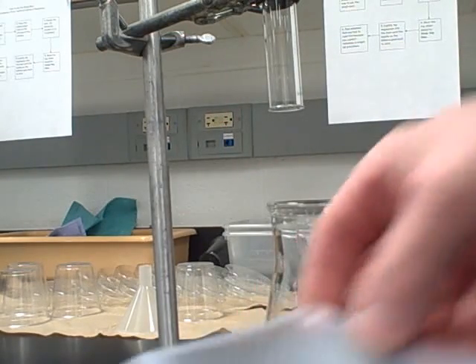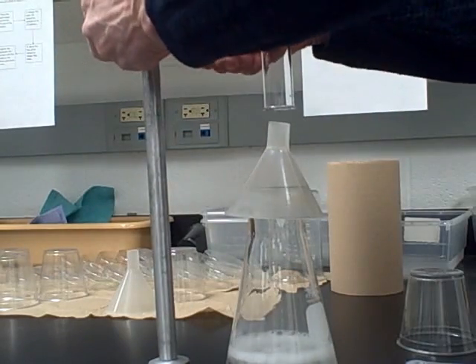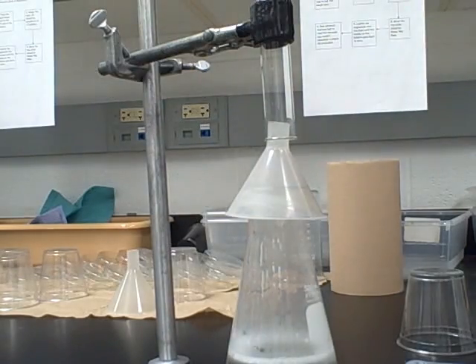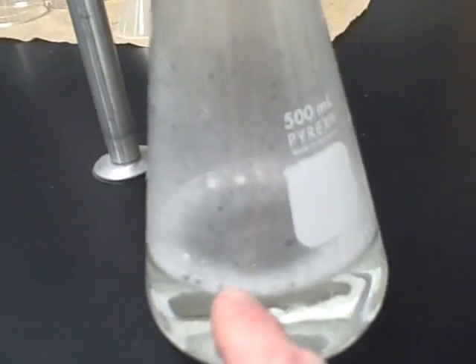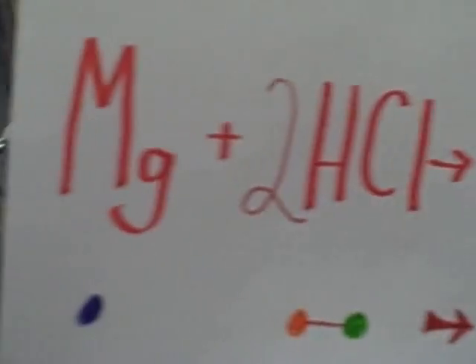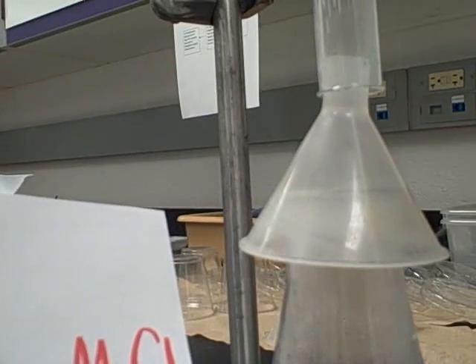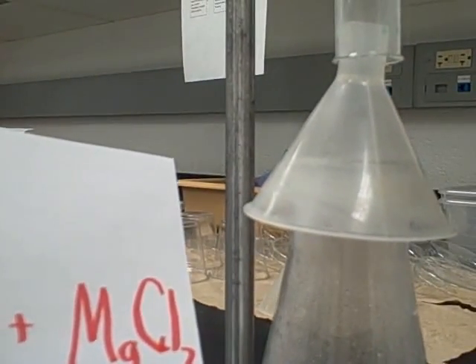Set everything up so you're ready to go. We pour the magnesium into the flask, the chemical reaction occurs, we slide the funnel under, lower the test tube down, make sure there's an air space at the bottom, and begin collecting the gas. You can see the reaction occurring — it's actually producing heat, you can feel the warmth. The magnesium combines with the hydrochloric acid to form hydrogen gas, which floats up, and magnesium chloride, which dissolves in the solution. Once the reaction is done — that's when the fizzing stops — we test for hydrogen gas.